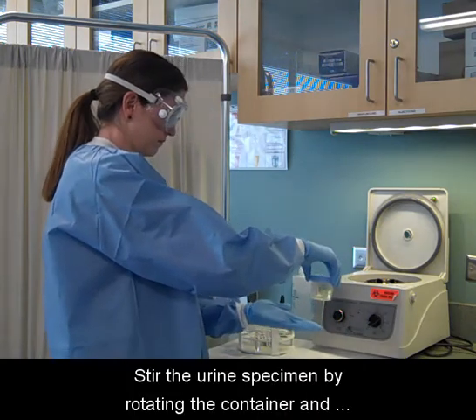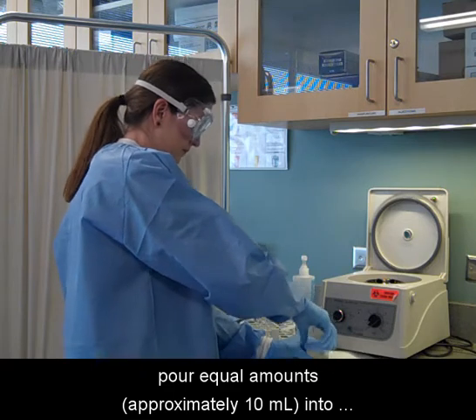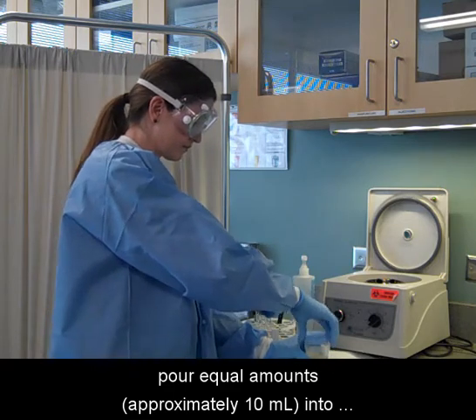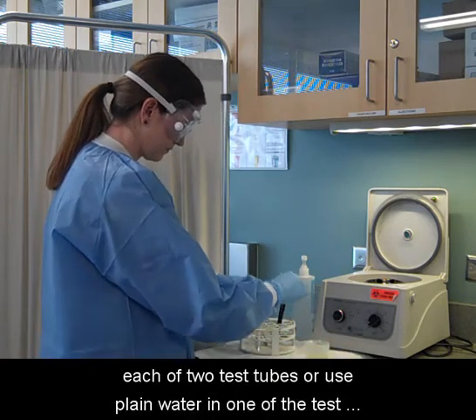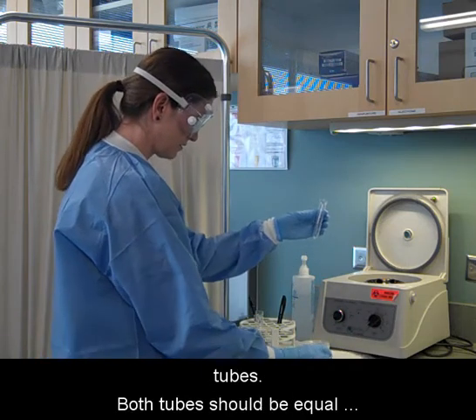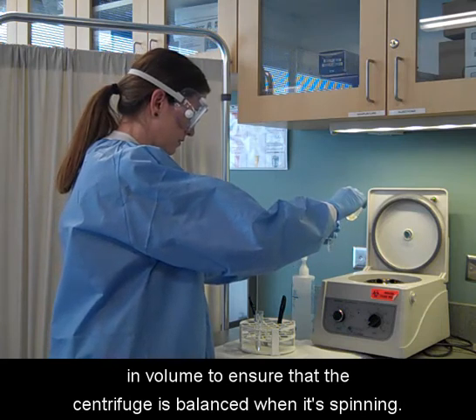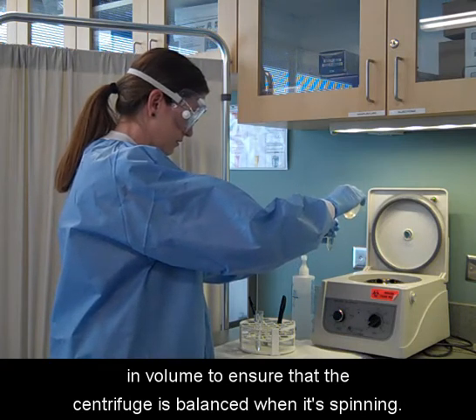Stir the urine specimen by rotating the container and pour equal amounts, approximately 10 mLs, into each of two test tubes, or use plain water in one of the test tubes. Both tubes should be equal in volume to ensure that the centrifuge is balanced when it's spinning.